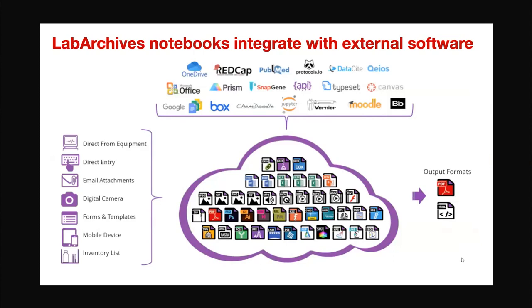So you can have a folder called gels, and whenever you have any new gels, you put them in that folder and they get uploaded automatically. But there is no desktop offline application, if that's what you're asking. Did I answer the question?